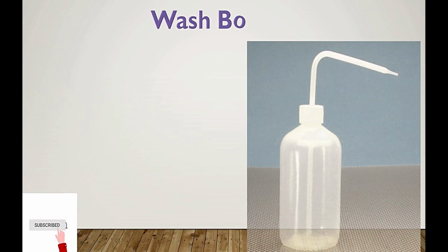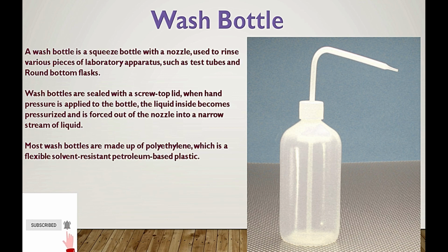Next apparatus is wash bottles. It is used to wash apparatus. A wash bottle is a squeeze bottle with a nozzle used to rinse various pieces of laboratory apparatus such as test tubes and round bottom flasks.